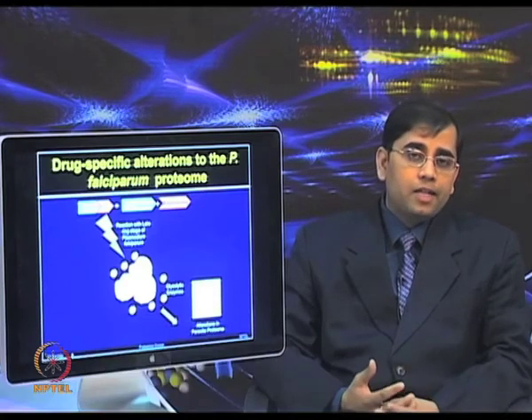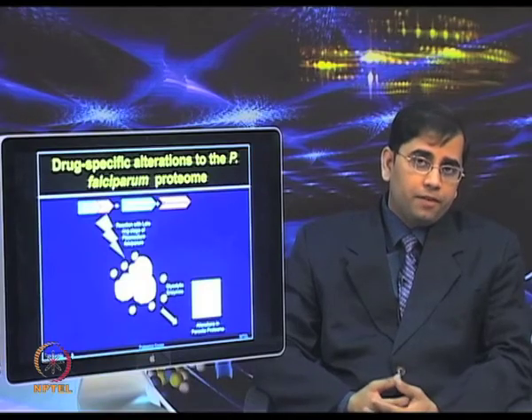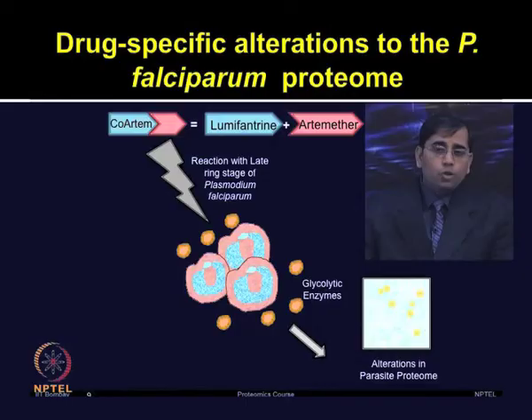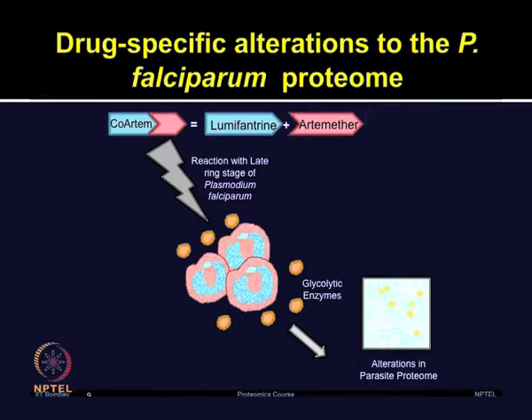the authors were able to see that there is a differential proteomic response which is drug specific. The quantitative analysis of the altered protein expression levels following exposure to ARM and LUM was performed, and those protein spots which were differentially expressed and statistically significant were further subjected to mass spectrometry based analysis.